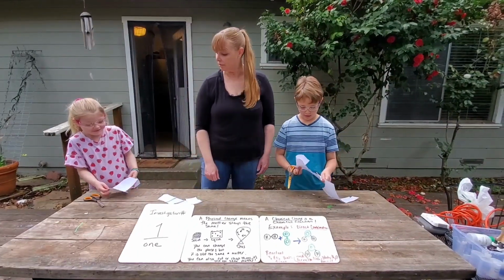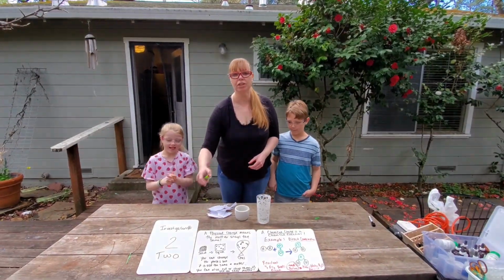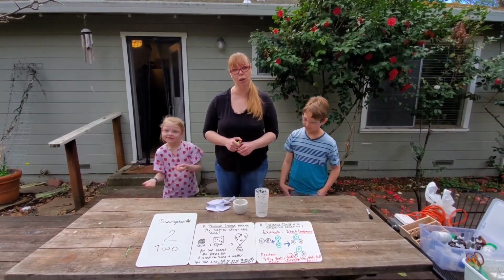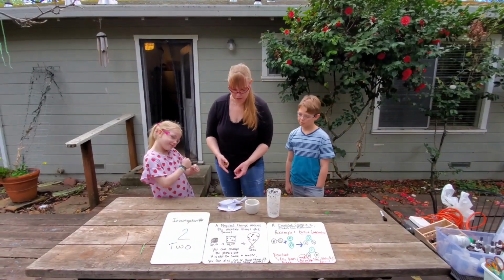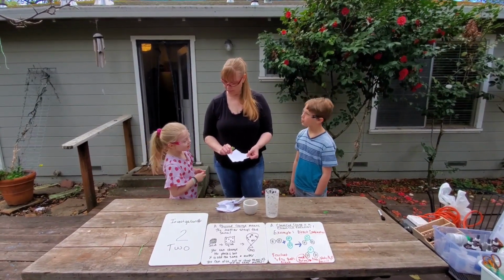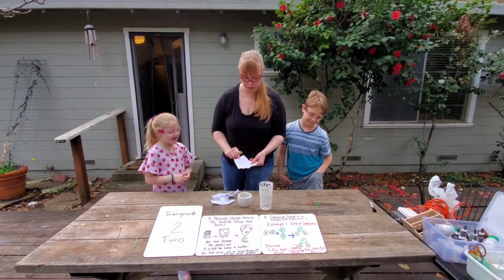All right, pause. Lab investigation number 2. I also want you guys noting qualitative and quantitative data every single time. So that means quality. Troy, Jewel, what does this look like? Piece of paper. What color is it? White. Okay, so white paper.